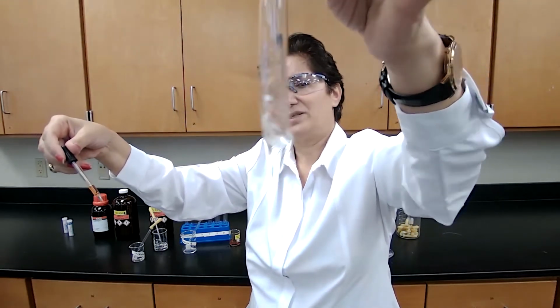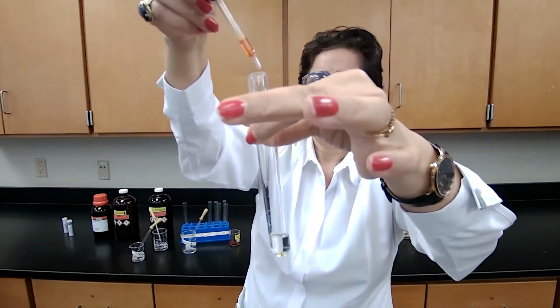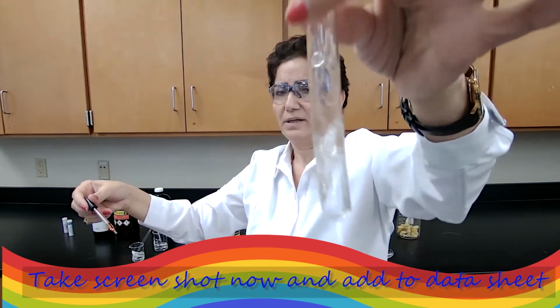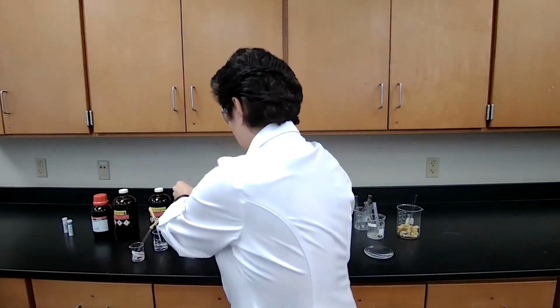Record your observation, and based on your observation, you could say this compound is unsaturated or it is saturated. Unsaturated meaning it has a carbon-carbon double bond. Okay, I think that's enough to prove the point.